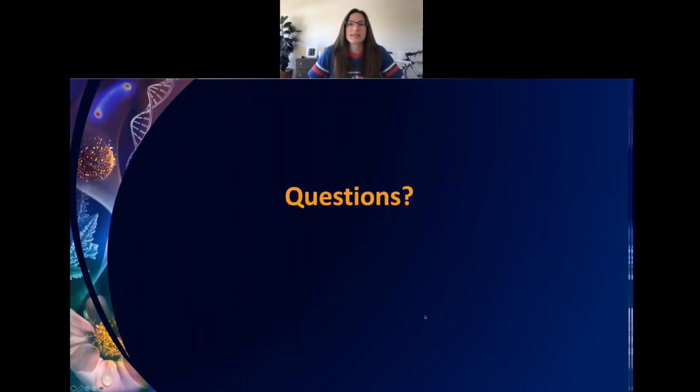And with that, does anyone have any questions about the RNA-seq overview? This was a beast of a lecture. It covered everything from the theories and technologies that led to the awesome revolution in sequencing by synthesis brought to us by Illumina, and followed all the way through to data processing and analysis.